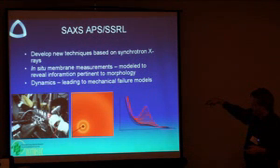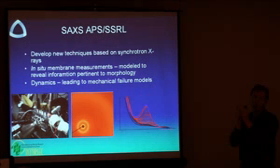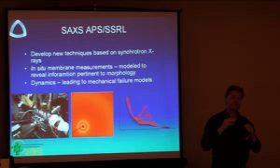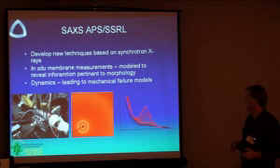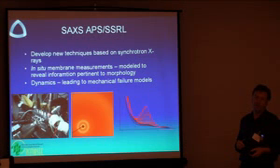We now have, this is now a 3rd generation oven where basically we can put in one of these proton exchange membrane materials and we can heat it in situ and humidify it in situ. And so we can either study film forming or humidification and drying processes.